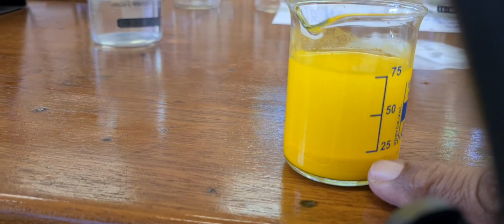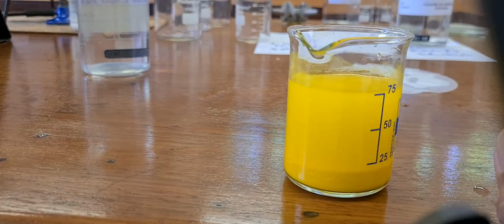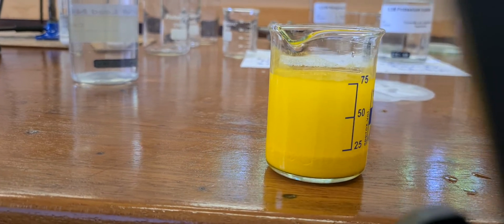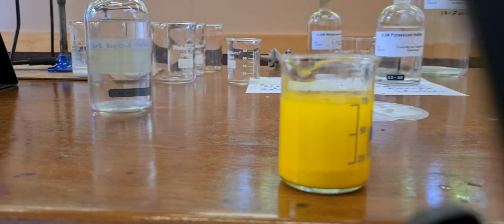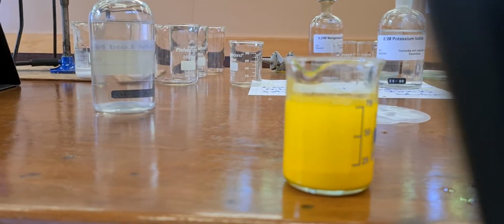Lead iodide is a spectacular yellow, and the solution above, if I leave it a few hours, that solution above will become perfectly colourless. All the yellow is down to the solid, and at the moment the top looks a bit yellow because the fine particles of solid are settling, and it will take time for it all to settle. Okay.